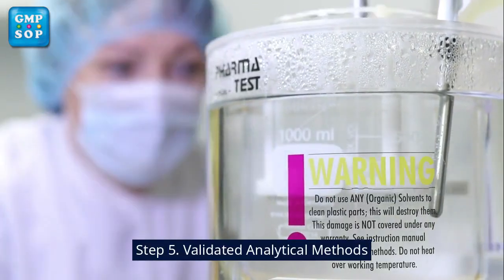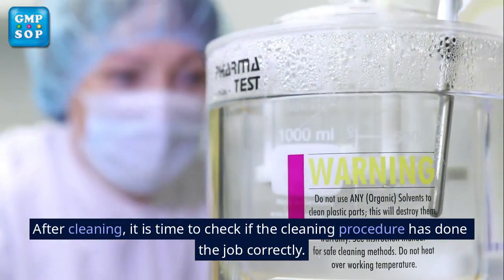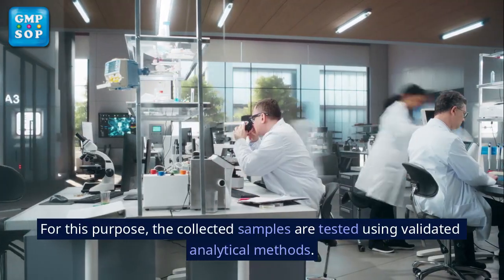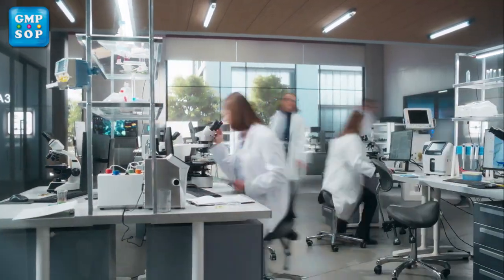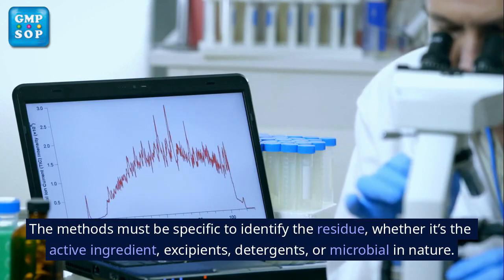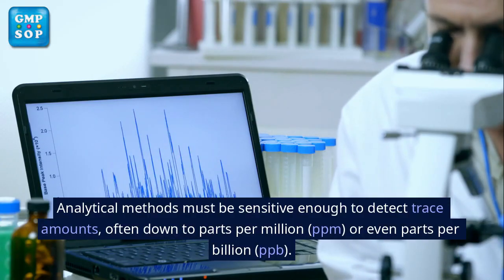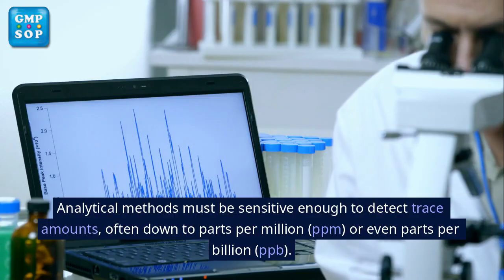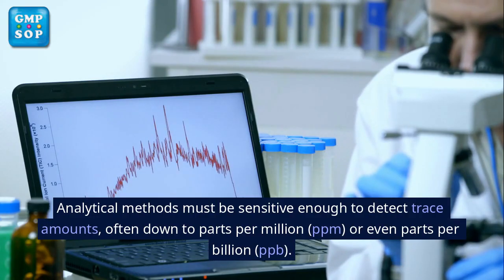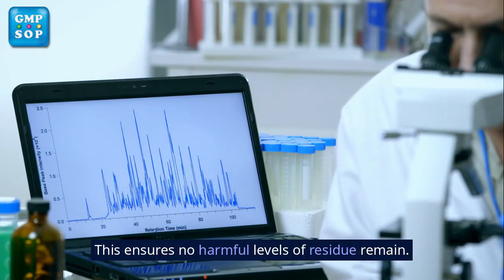Step 5. Validated analytical methods. After cleaning, it is time to check if the cleaning procedure has done the job correctly. For this purpose, the collected samples are tested using validated analytical methods. The methods must be specific to identify the residue, whether it's the active ingredient, excipients, detergents, or microbial in nature. Analytical methods must be sensitive enough to detect trace amounts, often down to parts per million, ppm, or even parts per billion, ppb. This ensures no harmful levels of residue remain.